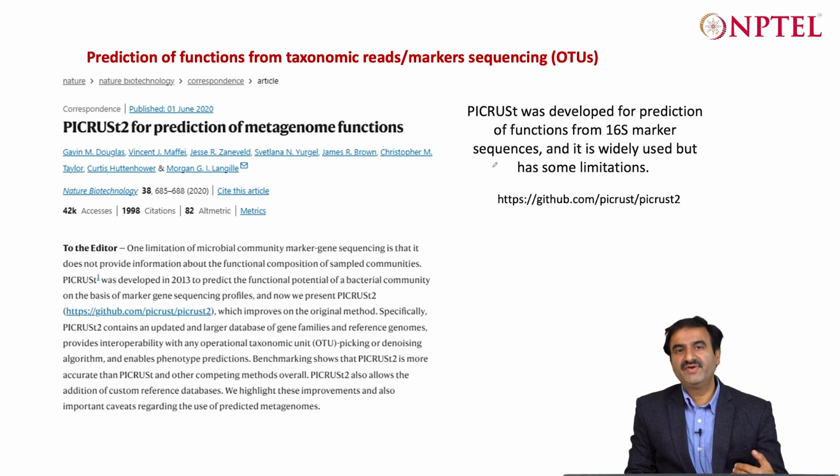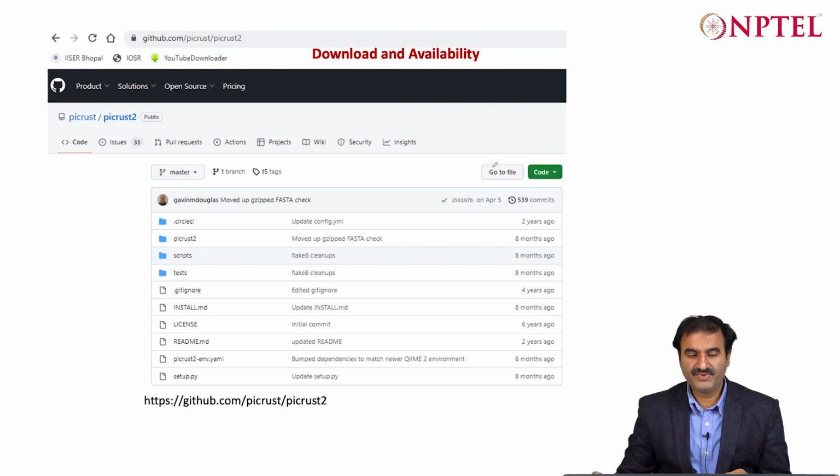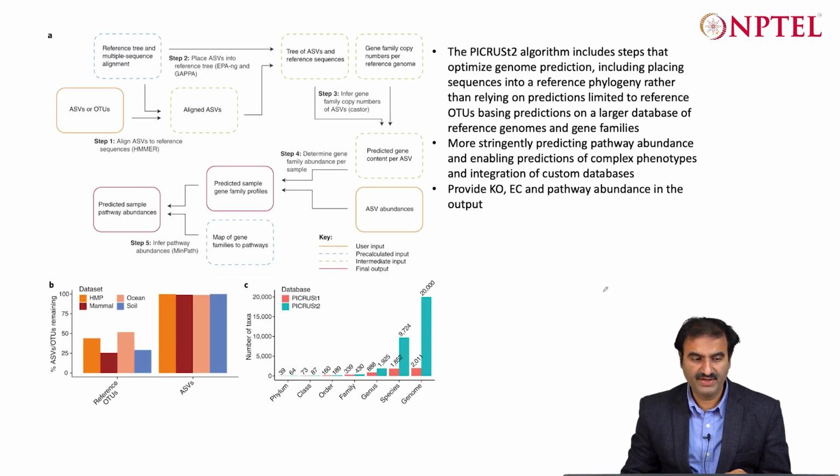And once the amount of data increases, like what genomes are there, and you have very good information about the markers from those genomes, even 16S ribosomal analysis should be sufficient, because it will be cheaper also. You can follow it with a PICRUSt approach, which uses the taxonomic information to retrieve the functional information from the genomes that already exist. So you can download it from GitHub, install and use it, okay.